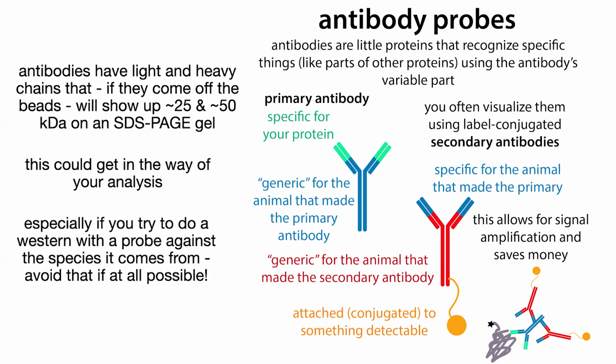So if those antibodies on the bead were made in, say, a rabbit, and then you used monoclonal antibodies to probe for something that were also made in a rabbit, and now you use a secondary antibody that's anti-rabbit in order to detect that primary antibody, well, now you're going to be detecting those antibodies that were used to capture the bait, as well as detecting the actual protein, like the primary antibody that was bound to your bait in your probe step.